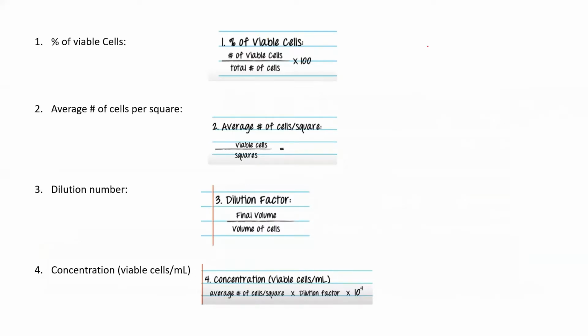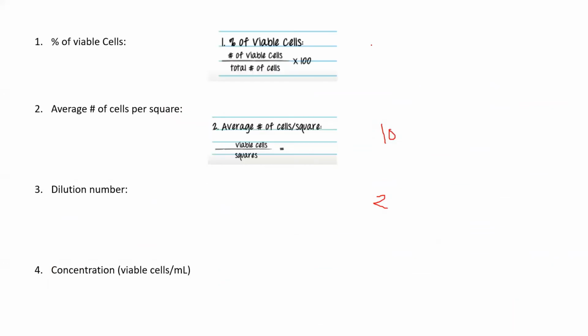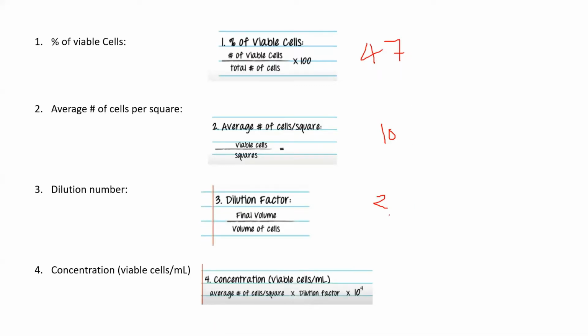Okay. So this is like 40 by 47. Number of cells is like 10. Dilution factor is 2, right? And what was the number I forget here? The 47, right? So you have 47 here, and that's it. You can divide it, and finally you have the 2.0, multiplied by 10 to the power 5 of cells. Okay, cells per milliliter. That is why you are putting this thing, to convert it into the milliliter.